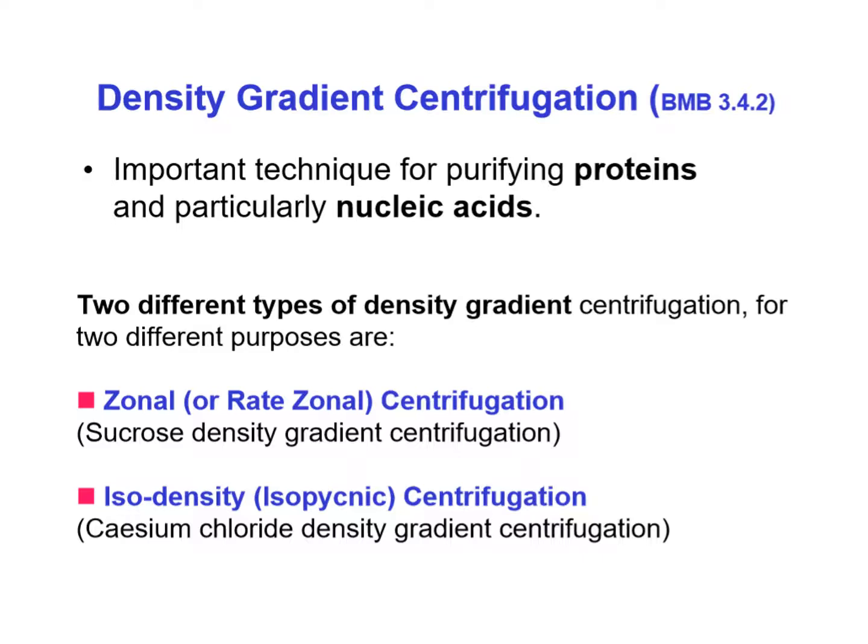We have density gradient centrifugation. This is an important technique for purifying proteins, certainly nucleic acids, and for organelles. This doesn't show that, but you could add organelles to your notes.